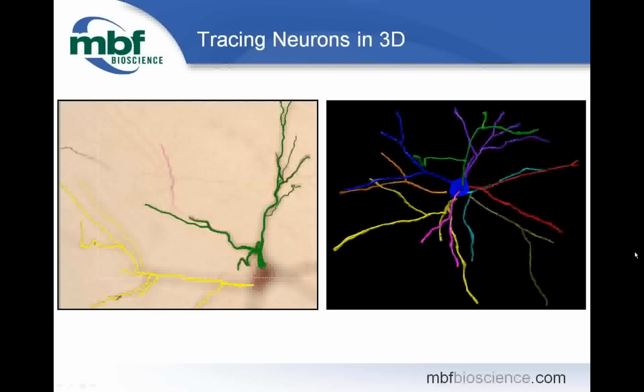You can save images with the tracing or save them separately. The tracing itself can be saved as a DAT or an ASCII file and can be stopped and started across many sessions by simply realigning the tracing with the histological section.